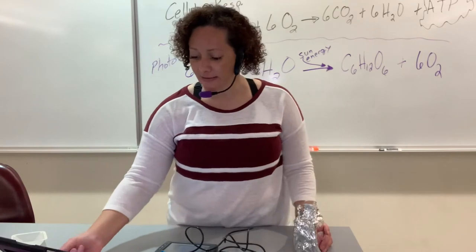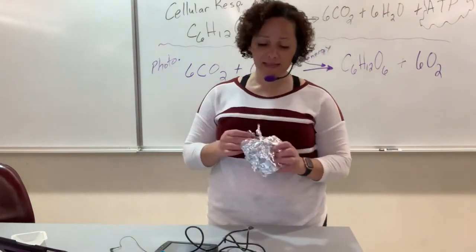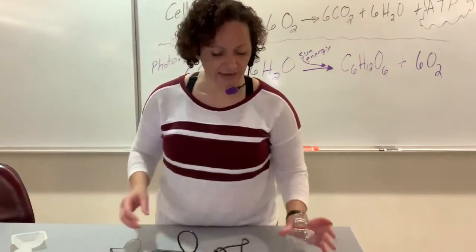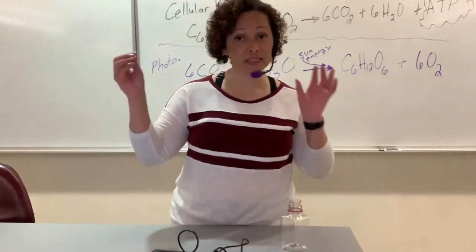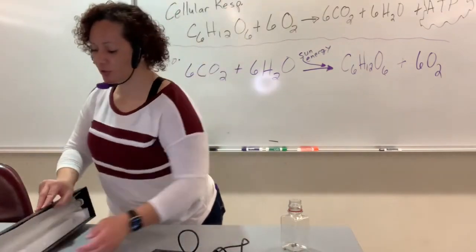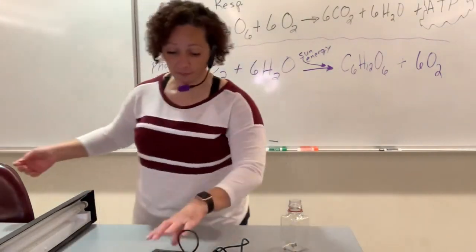All right, so next, you are going to do the exact same thing. I would probably just do it immediately, same organisms, in the light. So I just did it in the dark. And this is not enough light. We are going to have actual spotlights. I have brought this little tiny wimpy light just for illustration, but we are going to have lights that are going to be very, very powerful.